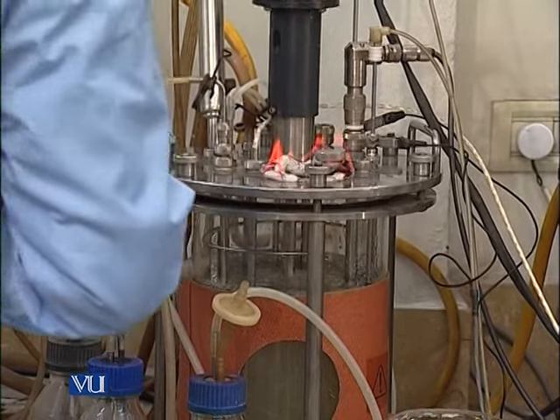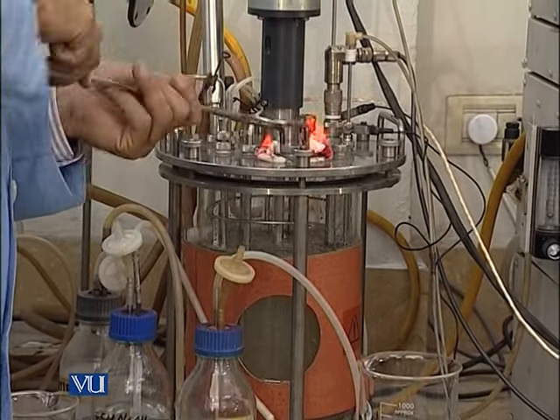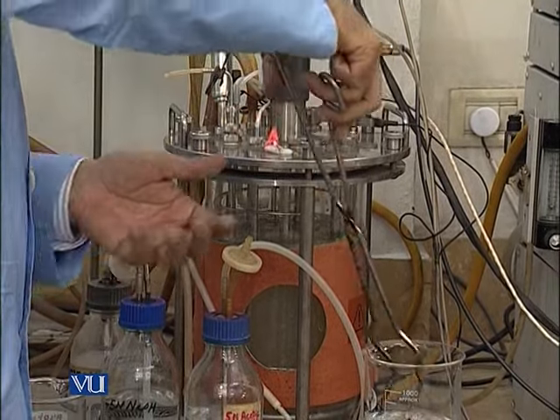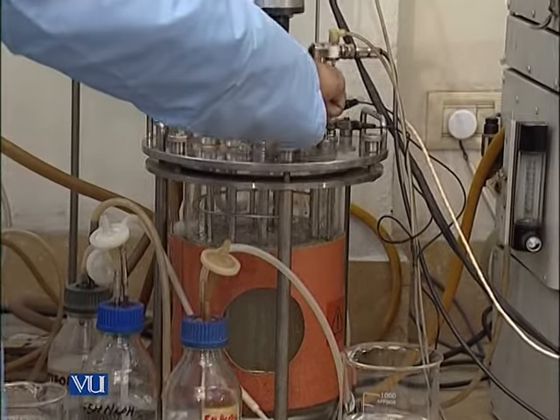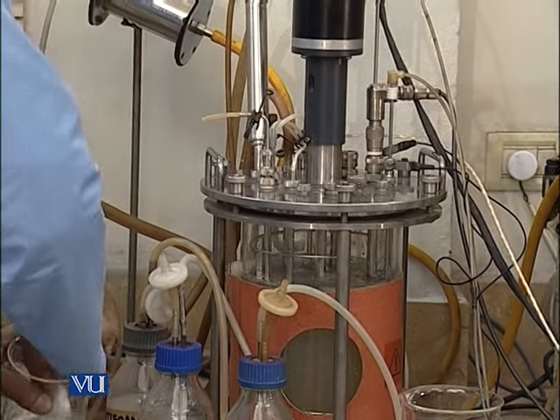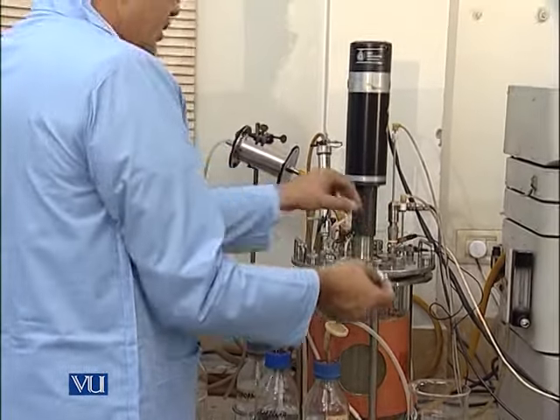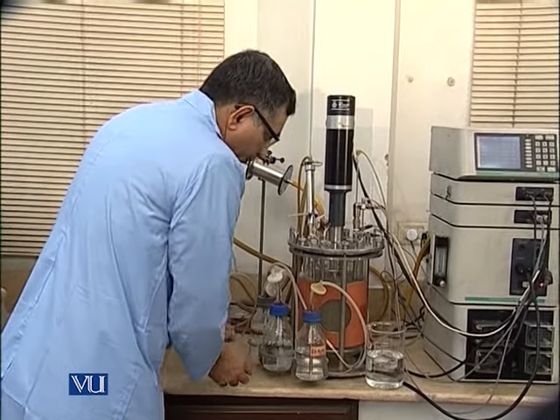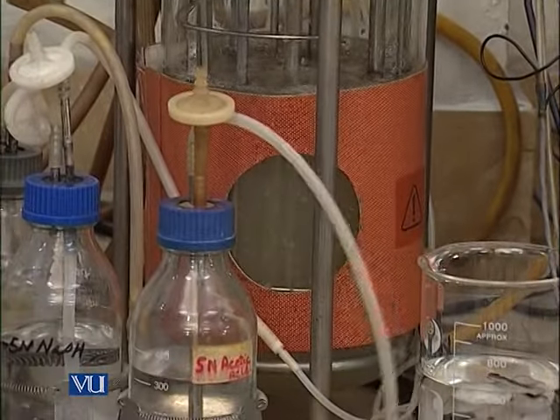When we complete this, we have to reclose this. When we have it normally closed, when we dip in the water, then we can gradually do this. But just for more safety, we can make it with this. So now, you can see inside the inoculum beads.